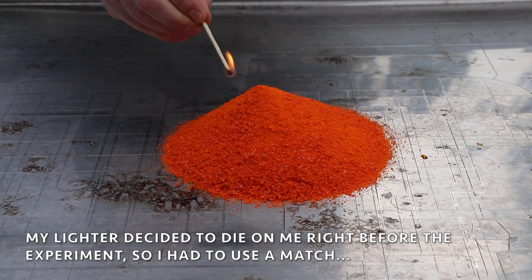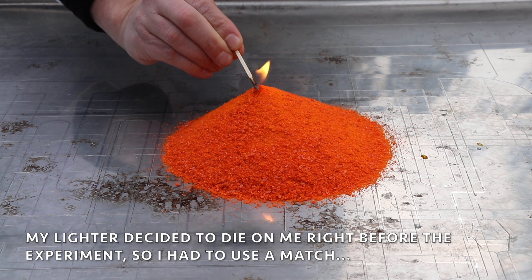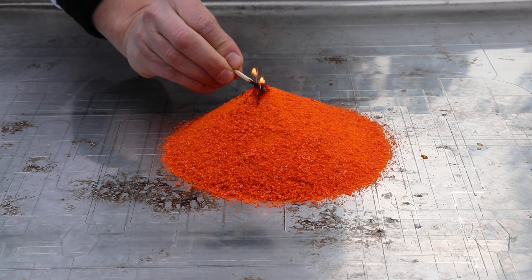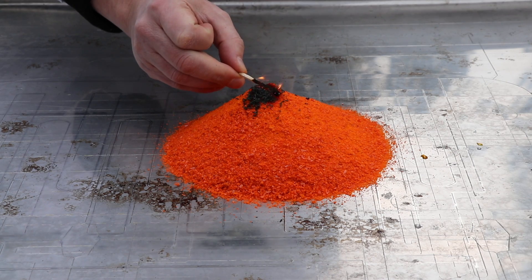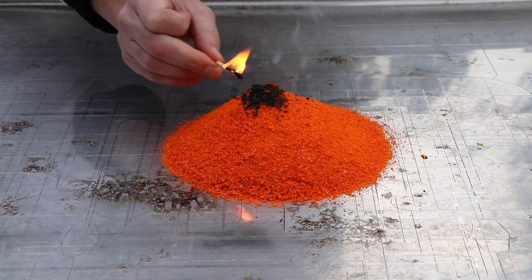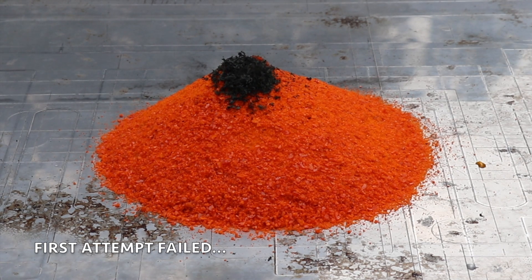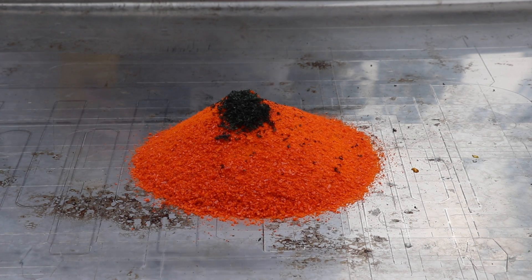Don't try this at home guys. It didn't work the first time — it was probably not enough fire. Well, let's do it again.